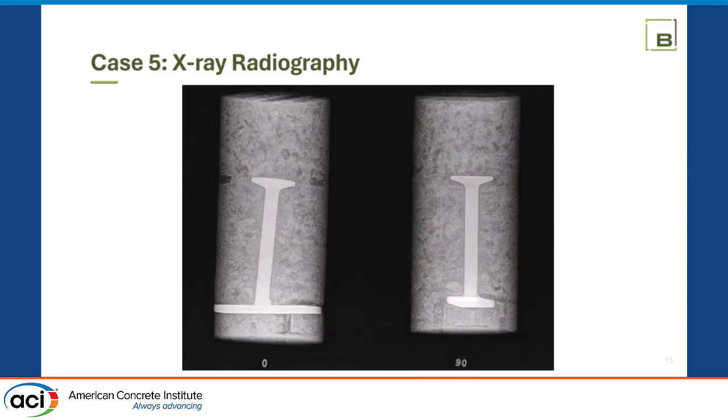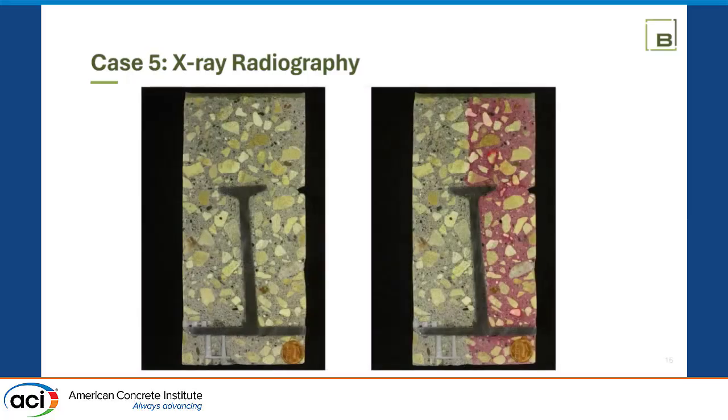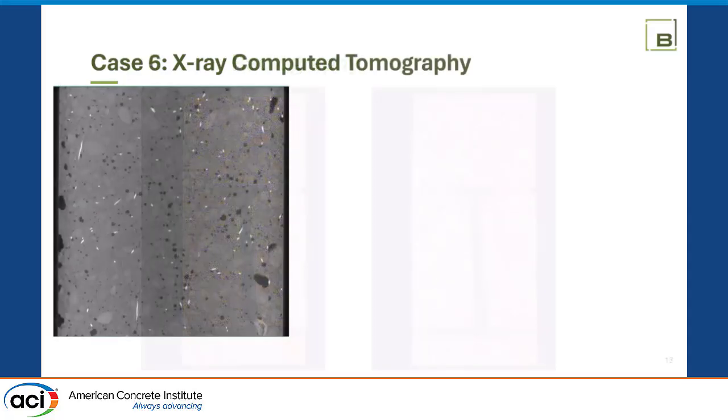Another little radiography experiment: a lot of times when I do the radiography, it's a sample and then rotate 90 degrees, to make my cuts more informed before I make them. And so that's what I did here. Just basically take the sample and rotate it so I can make the perfect cut and get that perfectly sectioned. So that's kind of old tech.